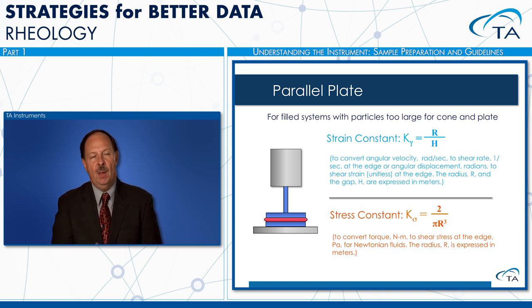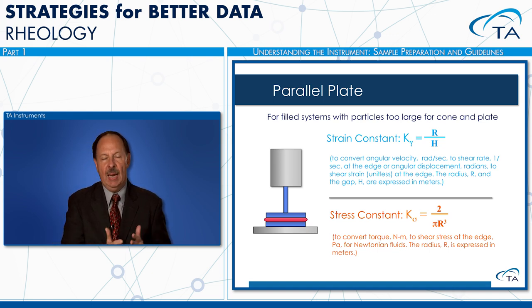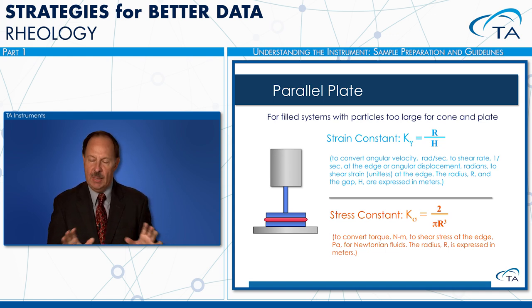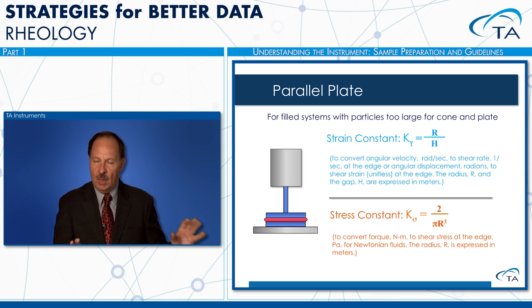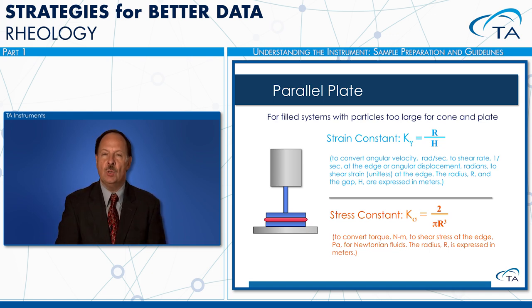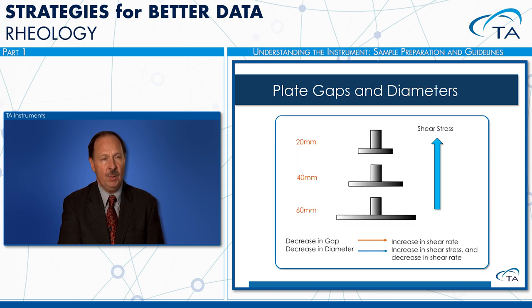Now, there are ways that you could convert the parallel plate data to cone and plate data, and that's available in our software packages. So if you need to compare data and either your customer or vendor just has the cone and plate and you have the parallel plate, you can do testing and you should be able to get a good comparison of your data using the correction factors that are available to go from parallel plate to cone and plate data, okay?